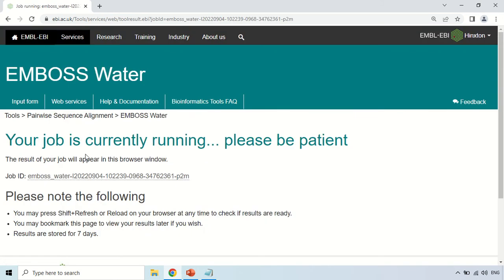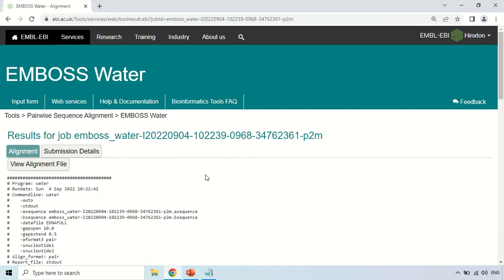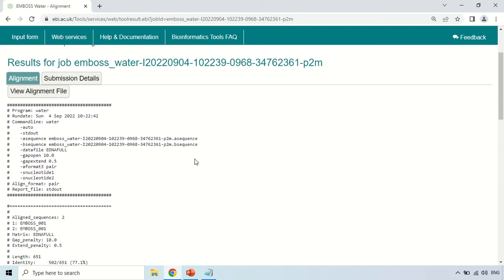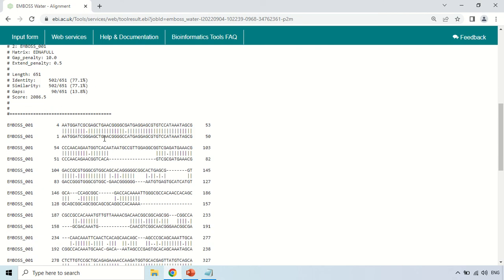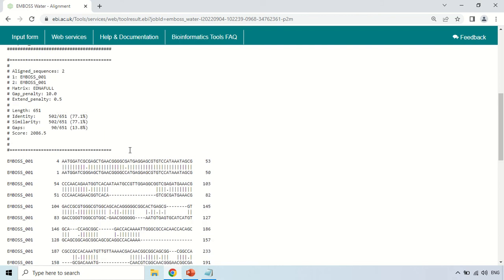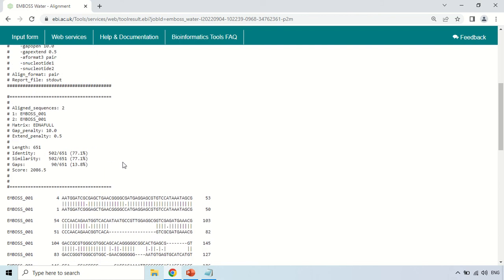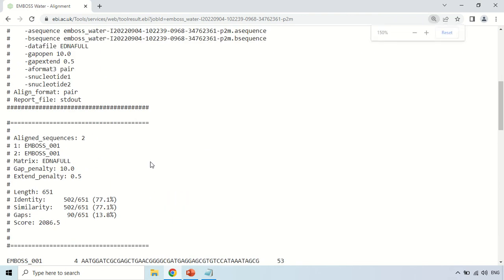As you click Submit, it will take a few seconds to show the result. You can see the job is currently running and this is the job ID. The results are now ready. I am zooming in so you can see them clearly.